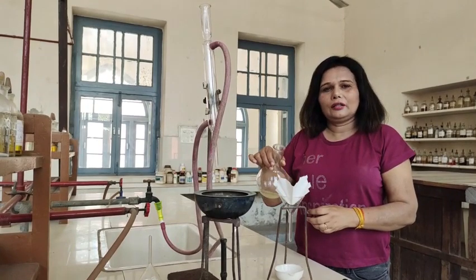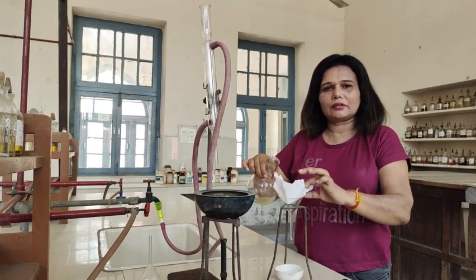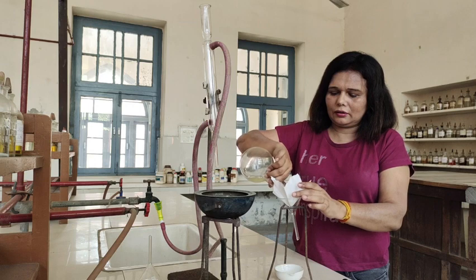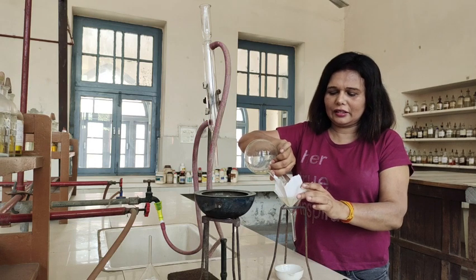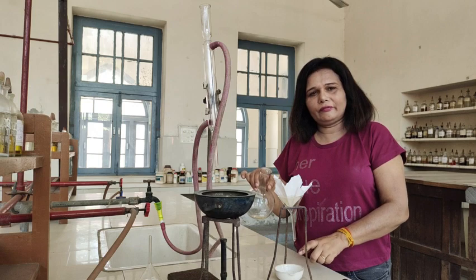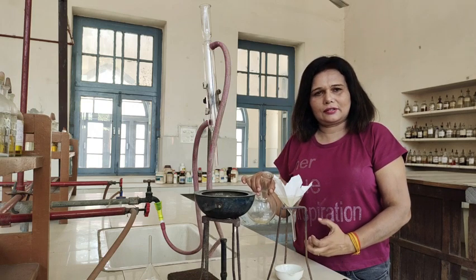Now we'll filter this hot solution using fluted filter paper, so that we get the filtrate in the china dish. Now the filtrate obtained in the china dish, we'll place in an ice bath so as to get the crystals of iodoform.